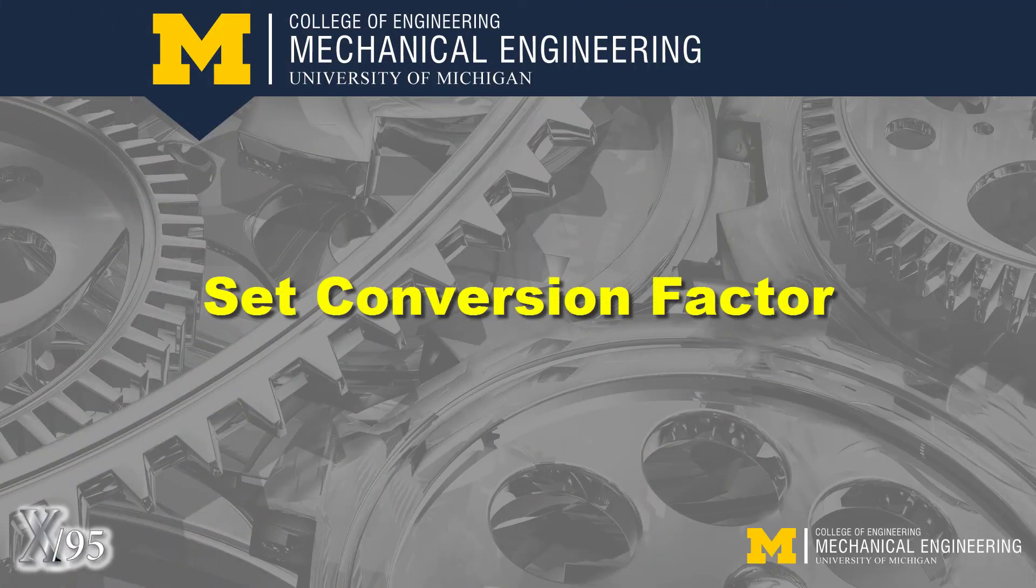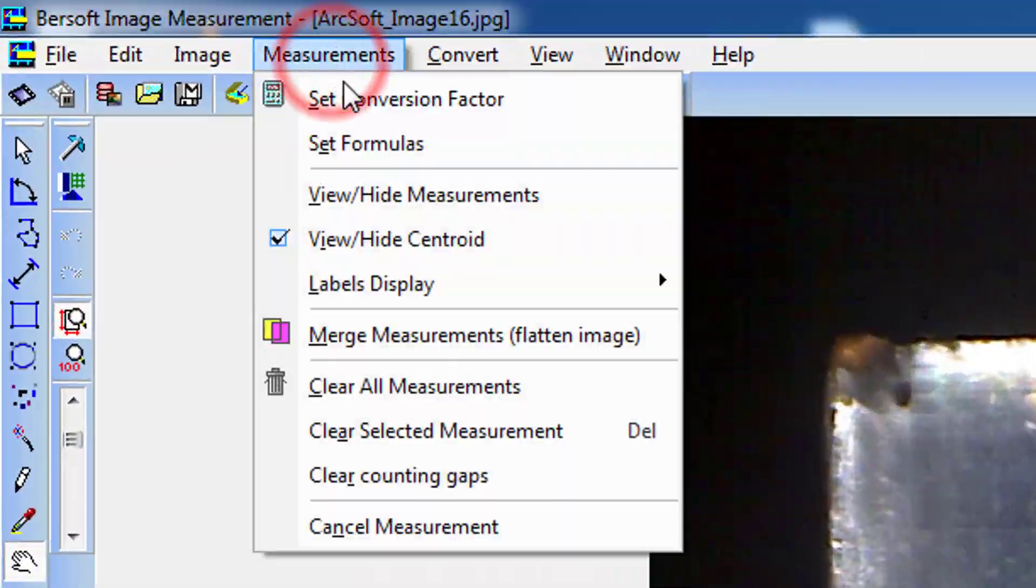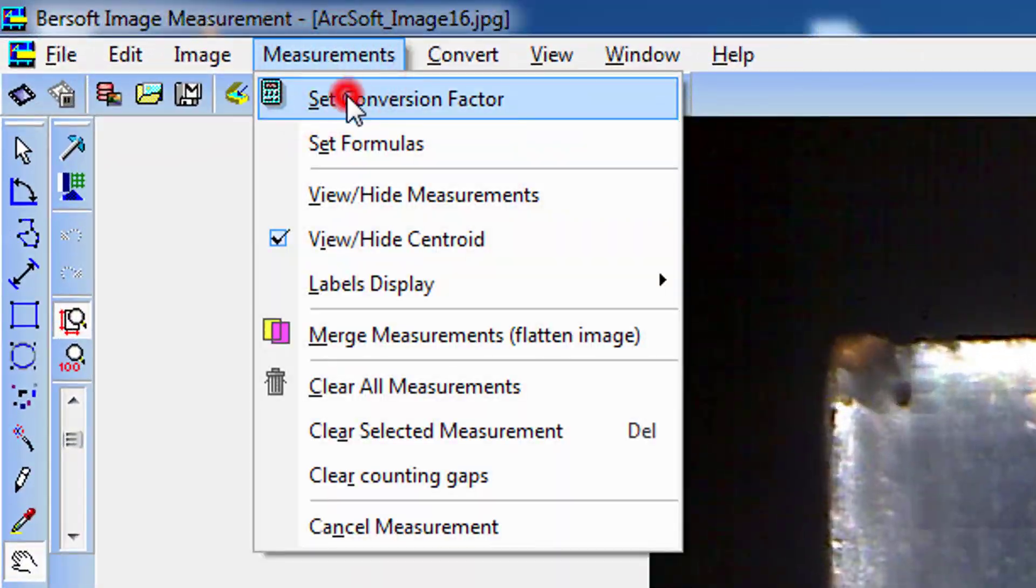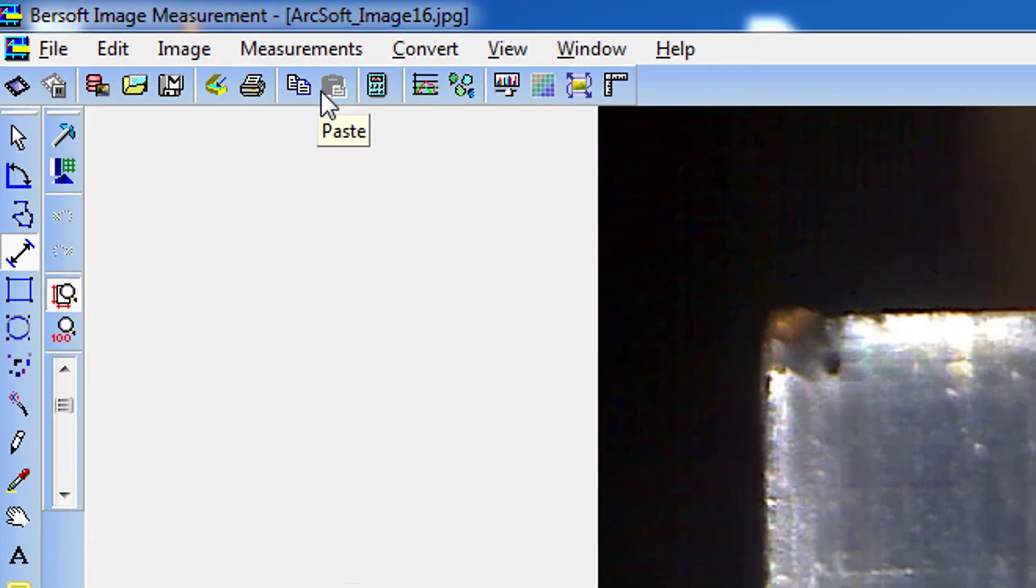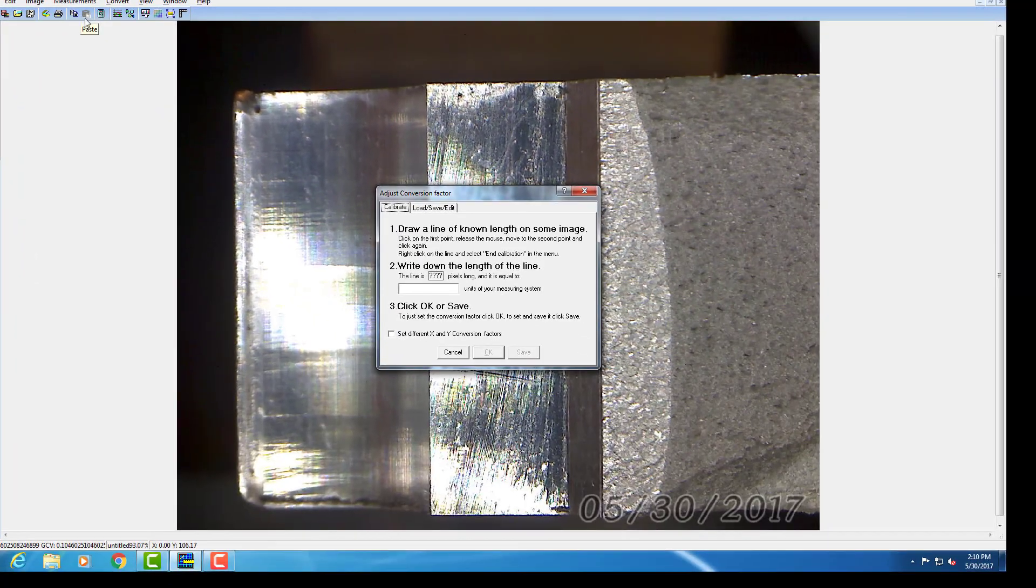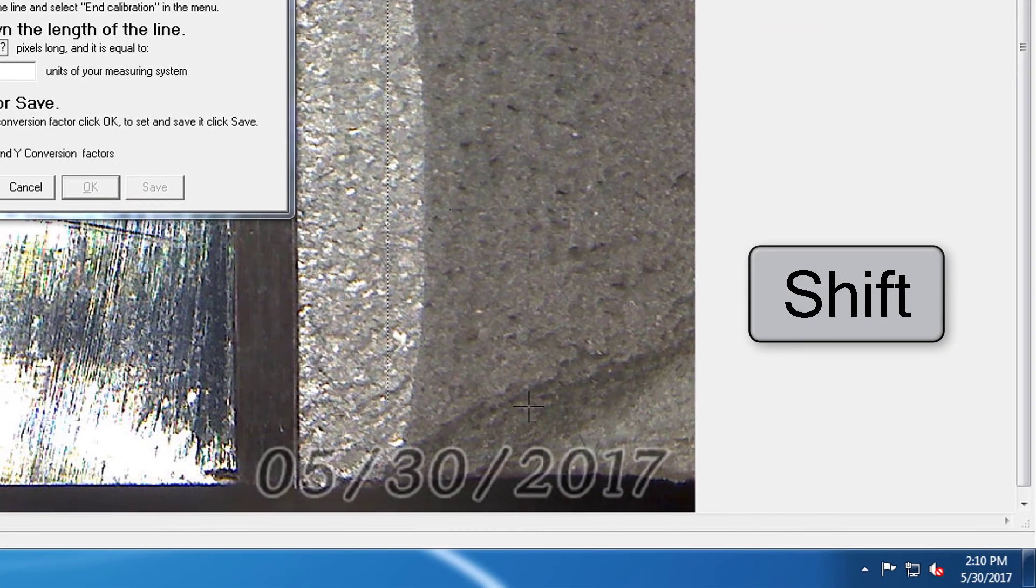We'll use the measured thickness to establish a conversion factor from image pixels to millimeters. Select Set Conversion Factor under Measurement in the menu bar. Select a point along the top edge and then press Shift to orthogonally move to the lower edge to select a second point.